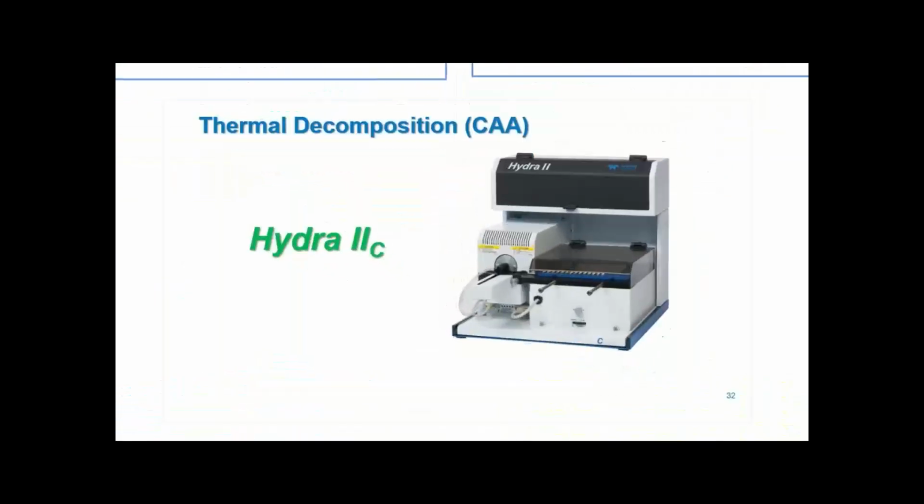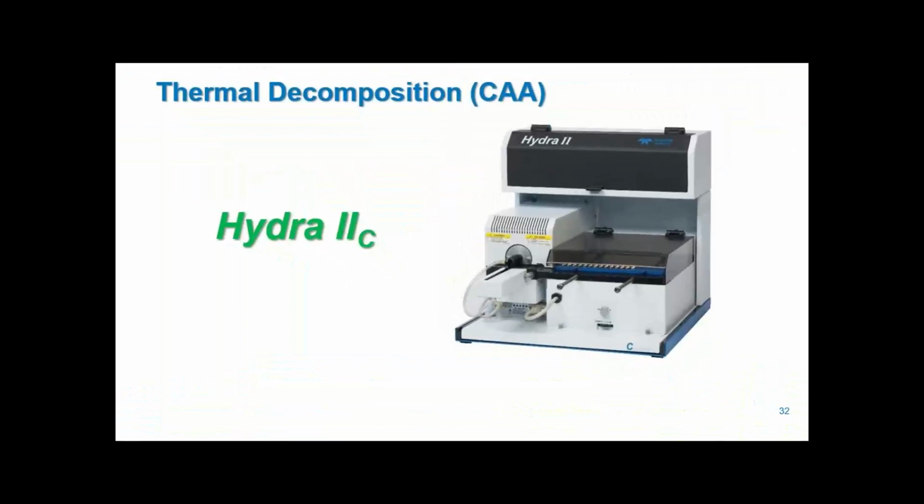So let's move right along here to the Hydra 2C. This is our last instrument to cover, and I know I'm not supposed to pick a favorite, but I think this is my favorite instrument. It's the Hydra 2C. It operates by combustion atomic absorption.